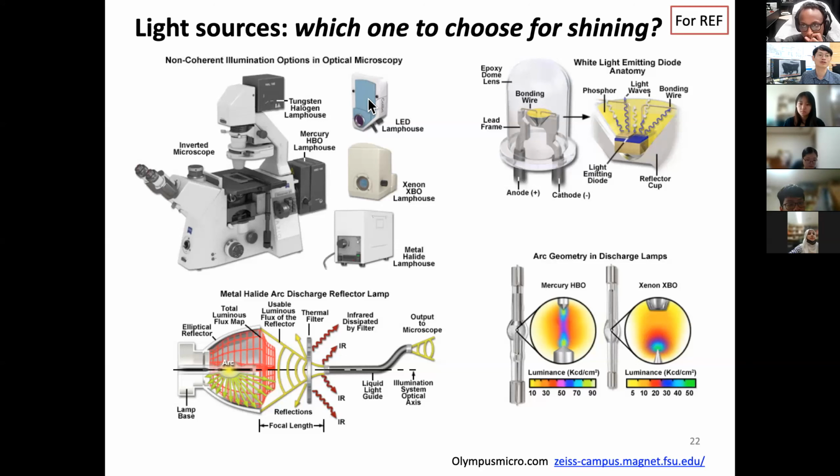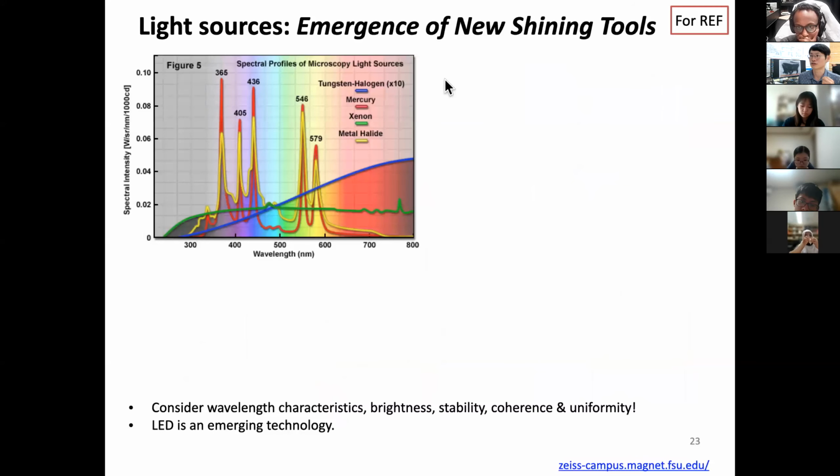So the question is when to use which, and why. Price-wise, the LED itself is pretty economical. Metal halide, I think, is about $3,000 per lamp, compared to this $200, but this one lasts much longer. Not forever, but that's the difference. Then you will ask, why not use LED everywhere instead of metal halide? And here you have to think of the spectrum.